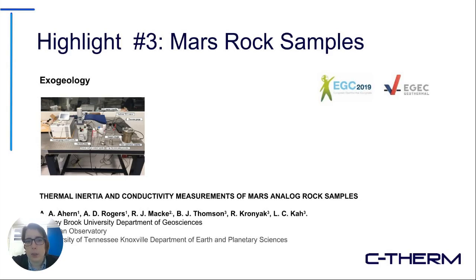Looking at highlight number 3. So this is basically an exogeology application, some work out of Stony Brook University, their Department of Geosciences. Specifically, they were looking at the thermal inertia and the thermal conductivity measurements of rocks designed to be analogous to Mars rocks, to help understand the thermal behavior of the kinds of rocks that you'd be likely to see on Mars, and potentially aid in design of future developments for Mars exploration.